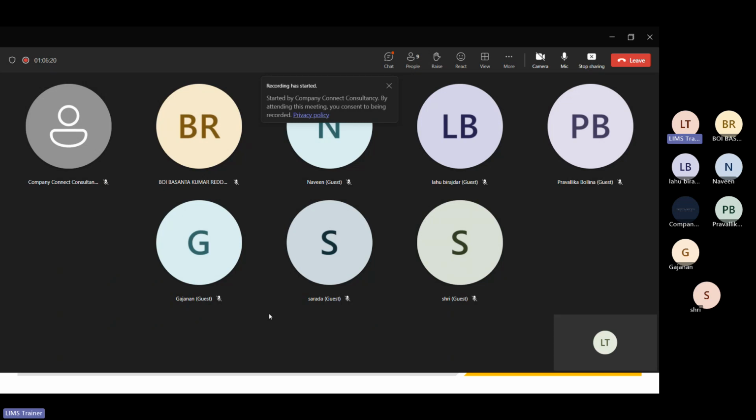The options and the buttons are given, you just go with them and do whatever functionality is required. Also, the reason it is included with screenshots is that it improves the speed of the class. That is the requirement, that's why we have designed it like that.